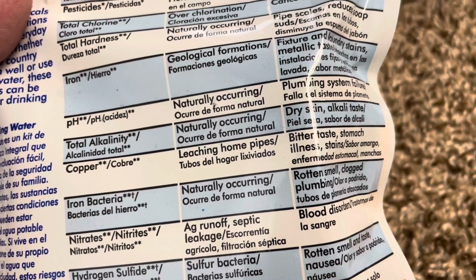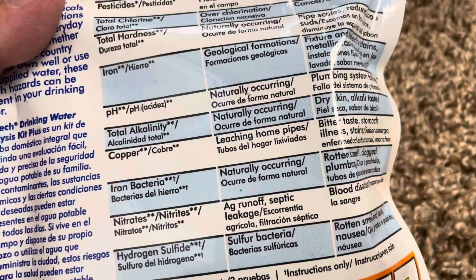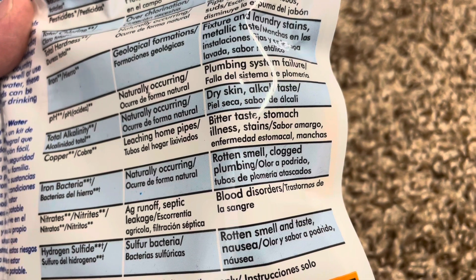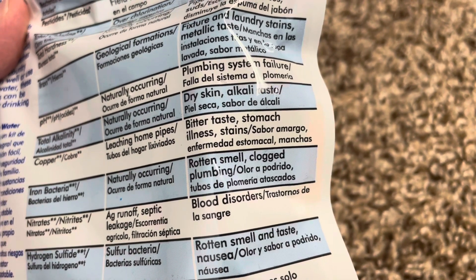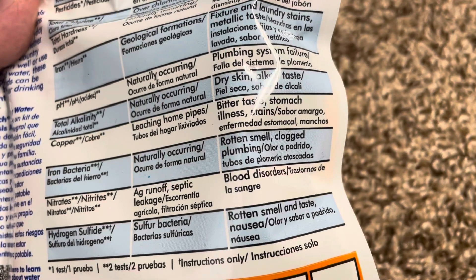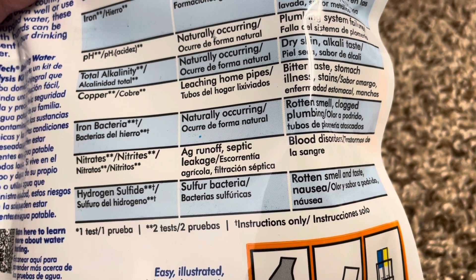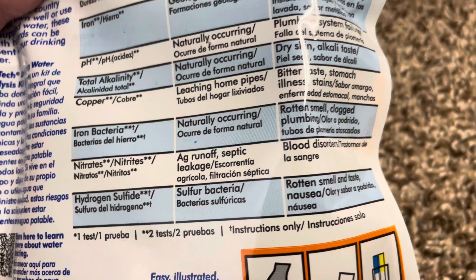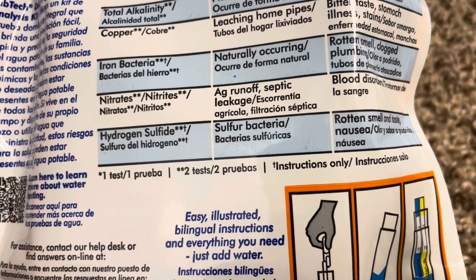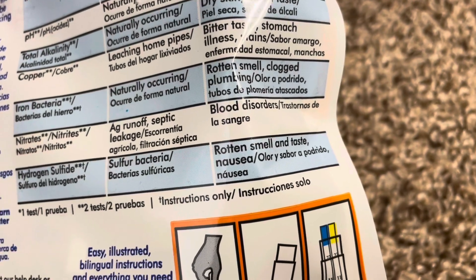Total alkalinity — possible source: naturally occurring; potential problems: dry skin and alkali taste. Copper — possible source: leaching home pipes; potential problems: bitter taste, stomach illness, and stains. Iron bacteria — possible source: naturally occurring; potential problems: rotten smell, clogged plumbing. Nitrates — possible source: agricultural runoff, septic leakage; potential problems: blood disorders. Hydrogen sulfide — possible source: sulfur bacteria; potential problems: rotten smell and taste, nausea.